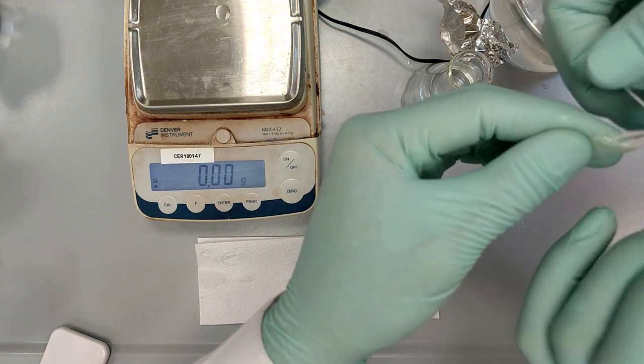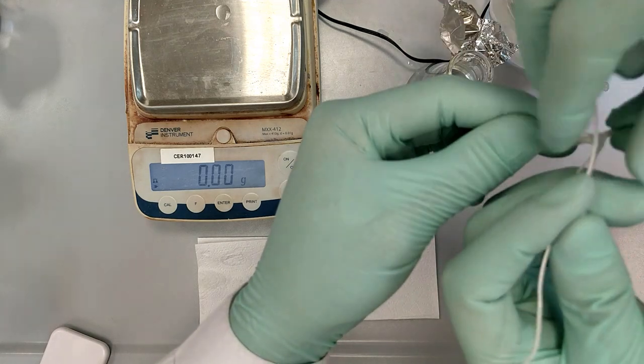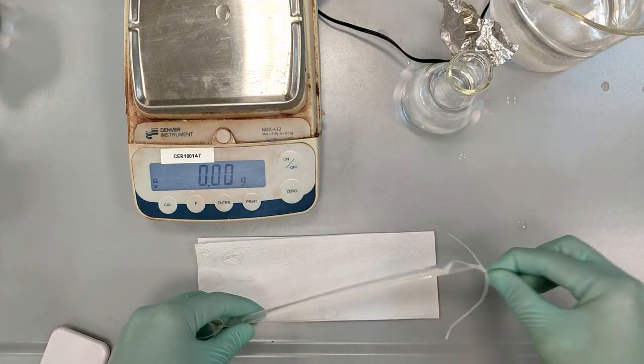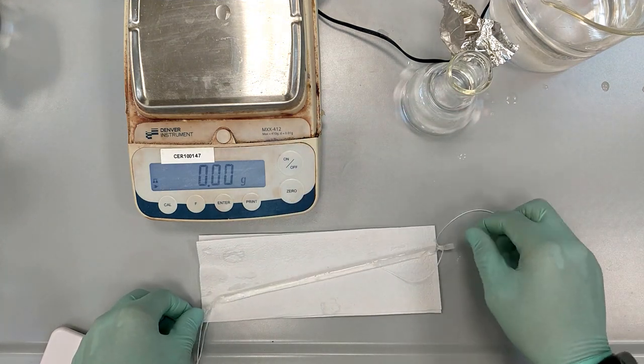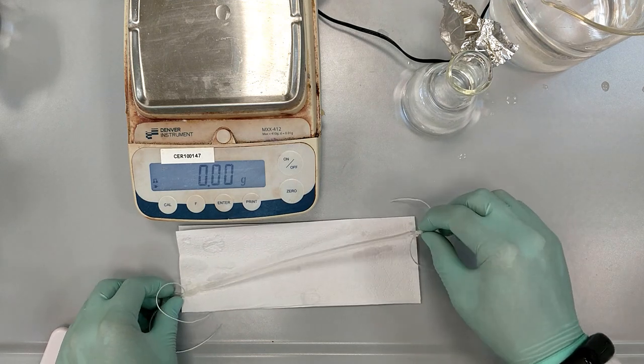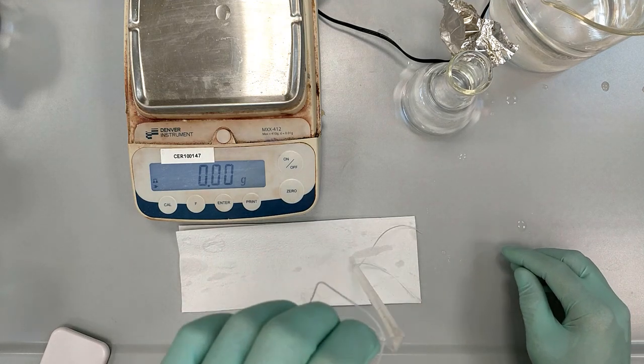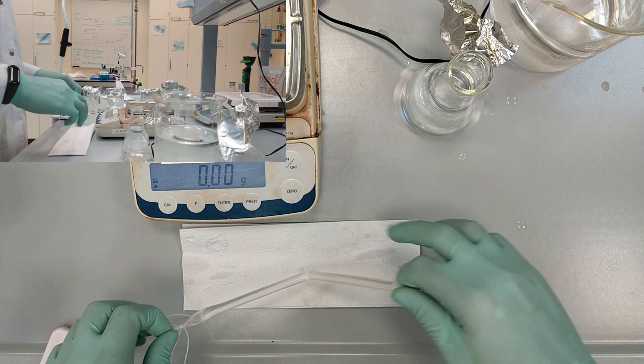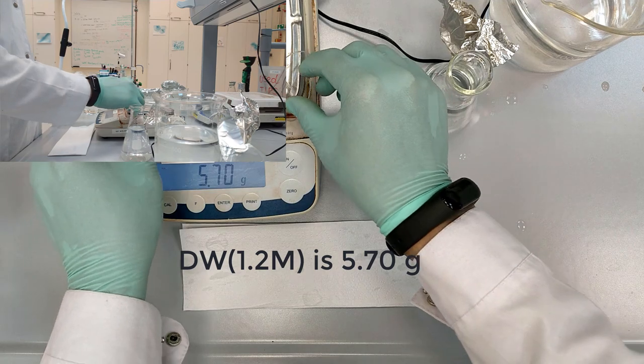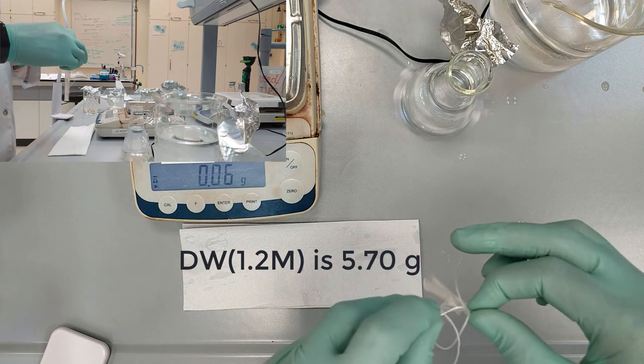You might have noticed that the volumes of our solutions of glucose changed from the previous videos. This is because we wanted to make sure that the conditions for all of the tubes are the same. So we prepared more solutions so that we have 200 ml in each of the beakers. So the last tube weighs 5.70 grams and we put it inside the beaker with the highest concentration of glucose.